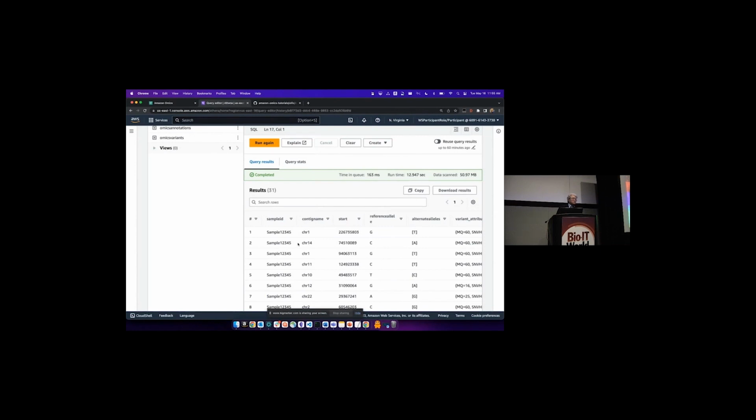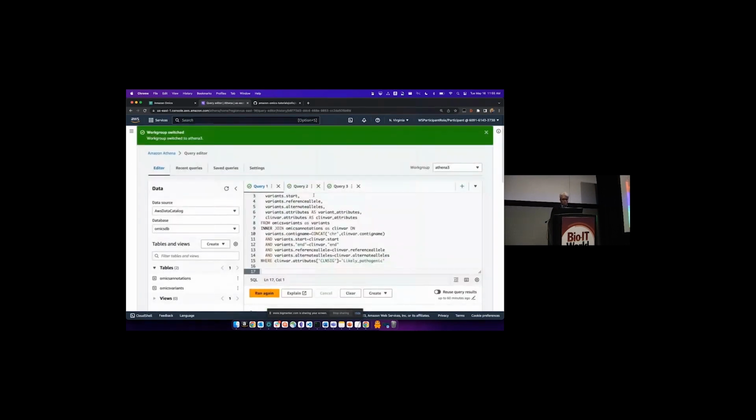The other thing it can do is, if the information you need is buried in one of those arrays or nested structures, Athena has, as part of its language, the ability to go into those arrays or nested structures and include that in the query. So you create a view, essentially. It will pull out whatever little bit of info you want and make its own column. Then you have the column between, and then you do the math. Or you can do a like or something. And if none of that works, usually you can use SQL.